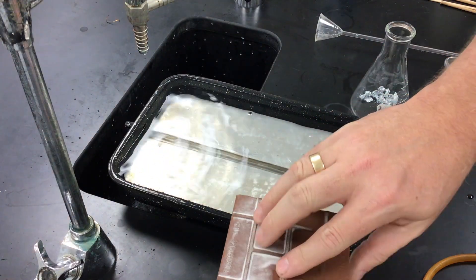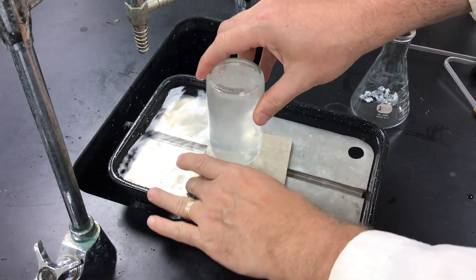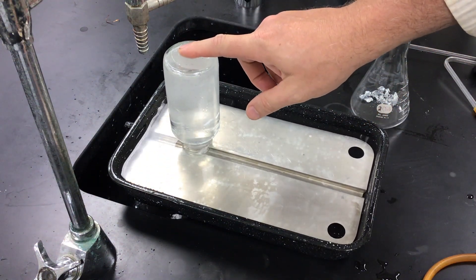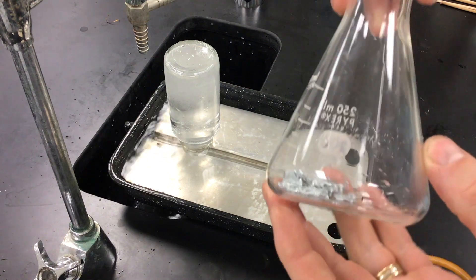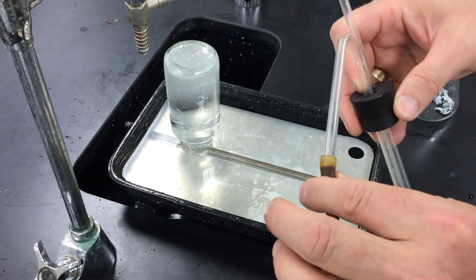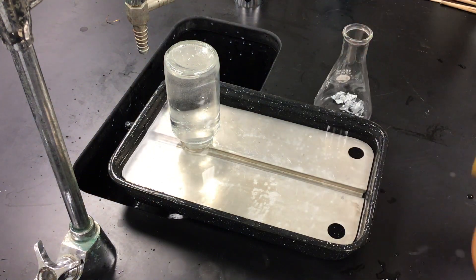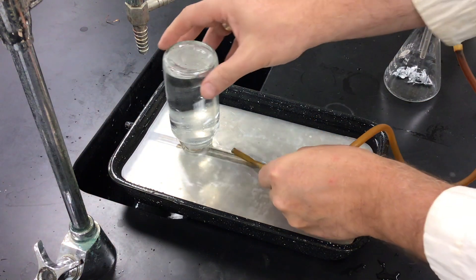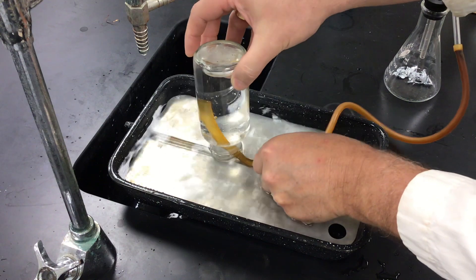We have our trough filled and our bottle full of water. I'm going to flip it over and place it in the pneumatic trough, then slide it off. The water stays up in the bottle. We have mossy zinc in an Erlenmeyer flask, along with a thistle tube, a piece of bent glass, and a hose attached to the end. I'm going to put this on top of the Erlenmeyer flask and place the end of the hose up underneath the bottom of the inverted water bottle.